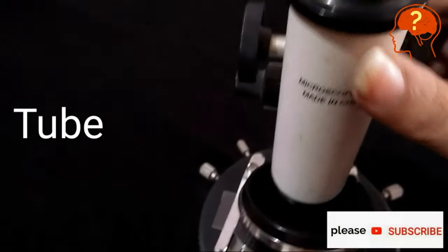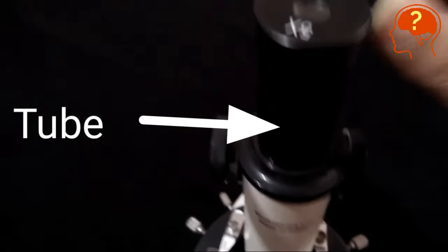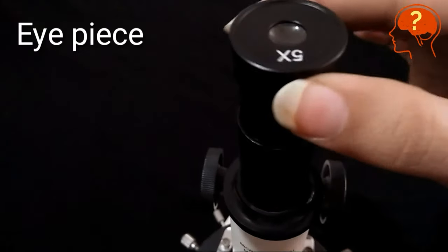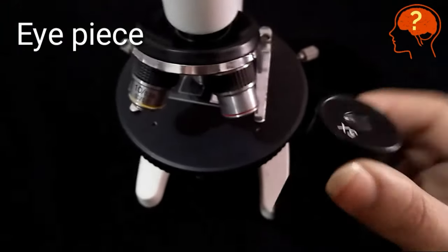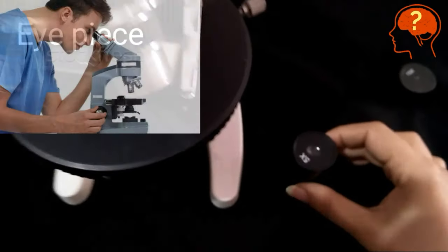This structure is called the tube that connects the eyepiece and objective. This is the eyepiece, the lens through which we see the specimen.